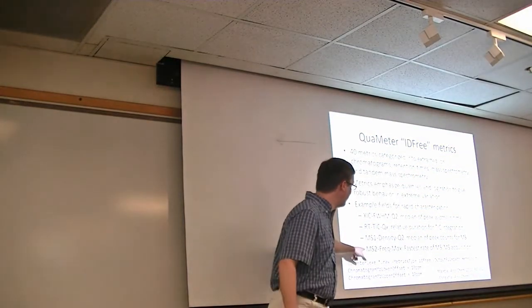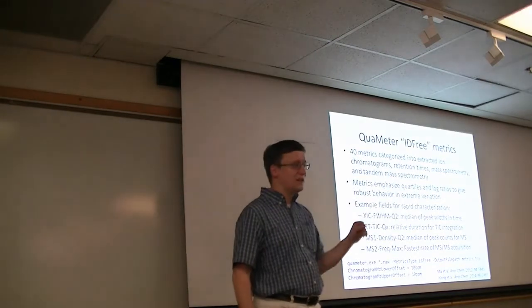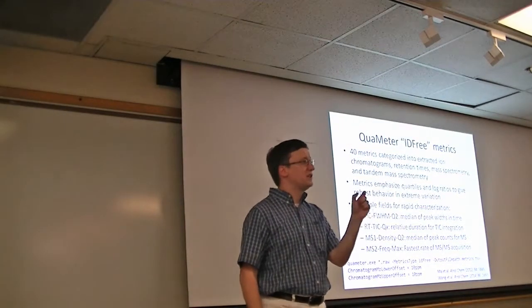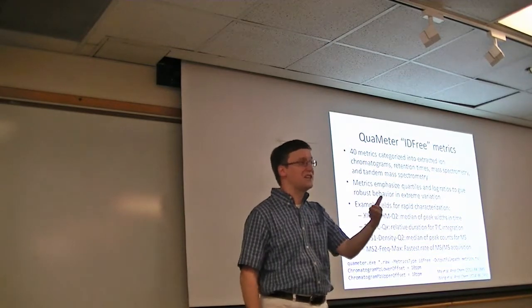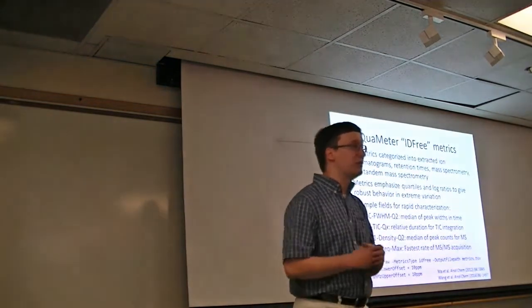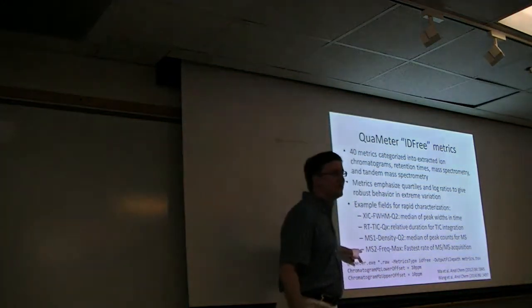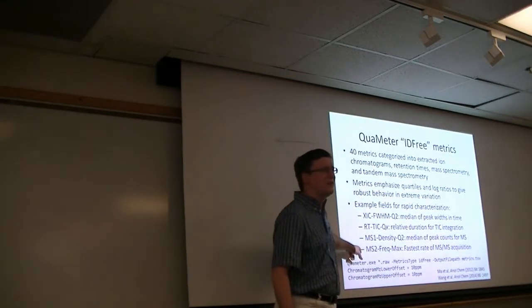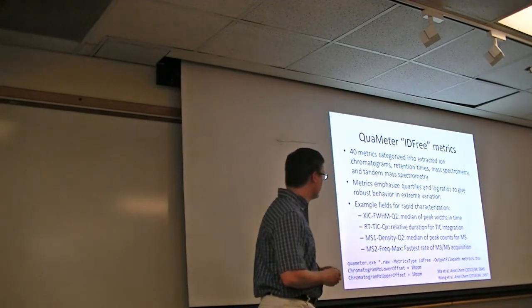So this frequency asks for any given minute in this experiment, what was the largest frequency? What was the largest number of scans per second that we were able to achieve? So typically we see that this value is on the order of like 10 per second if you have something like a Q-exactive firing away time and time again.